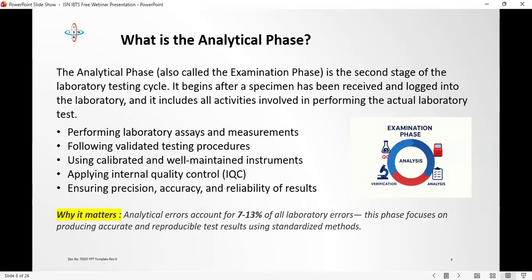And one of the biggest risks here is ignoring quality control signals. So this is where you need to look at your quality control signals. There are situations where QC results are slightly out of range, and due to pressure or workload, someone decides to manage it or proceed anyway. Sometimes you run your quality control and it fails, and you look at it, the result is close to the range, and because you have a lot of samples to analyze for that day, you say, let me just overlook and continue. This is a great risk.